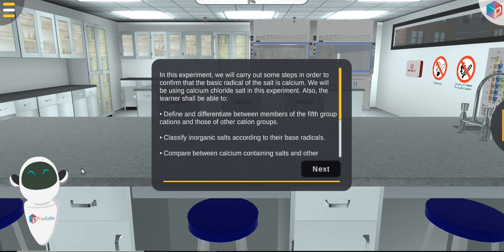Here are some of the features you can see. It will prompt you. This will serve as a guide, something that will guide you on the steps to take in case you made a mistake. And of course, on your screen, the instructions will pop up to direct and guide you on what next to do.